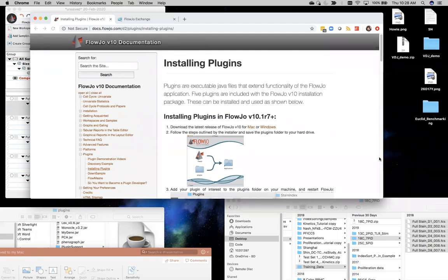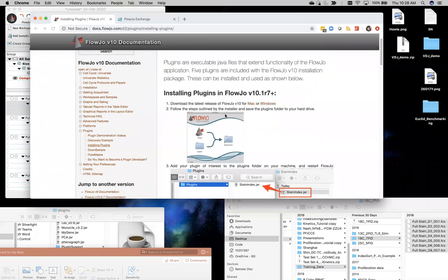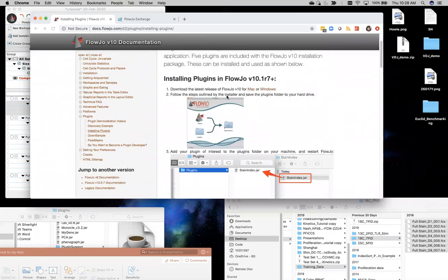And if you notice that TriMap isn't doing the job you expect it to, maybe try t-SNE, because obviously that's going to give you a totally different representation of the data based on the local structure of that data.